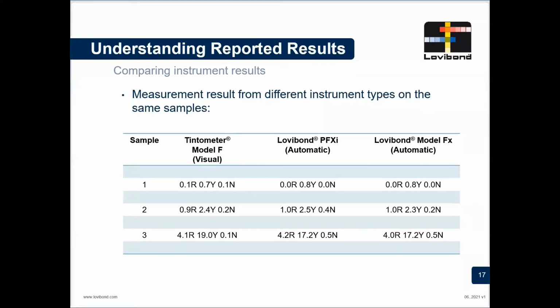And then we get a little bit higher. We're looking here at 19 yellow, 17 yellow, 17.2. And looking at our table, yeah, we can expect some sort of repeatability, maybe in the realms of about 1 to 2 units, maybe a little bit more, depending on our laboratory. So you can see here that although the numbers look a little bit different, generally they would fit in with what we expect from the type of repeatabilities and reproducibilities that the standards suggest that we might have.